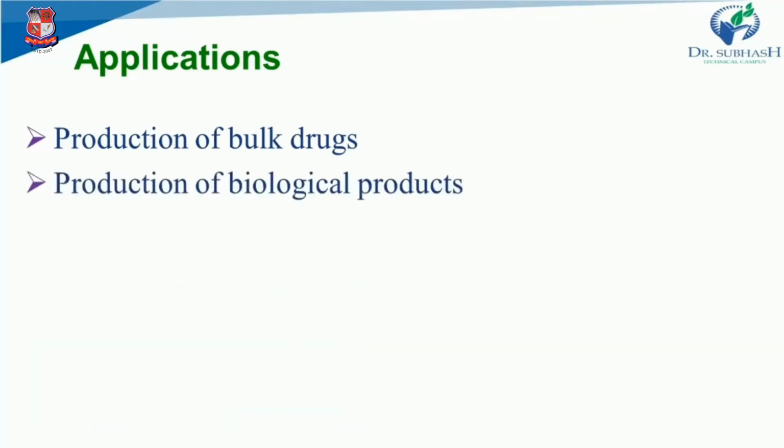The second is production of biological products. Most of the protein drugs and macromolecules are present as a colloidal dispersion in water. By normal methods, it is very difficult to produce them on large scale, but centrifugal methods are useful for preparation of these types of components. Insulin can be obtained in pure form by selectively precipitating other fractions of protein and subsequently separating them by ultracentrifugation.